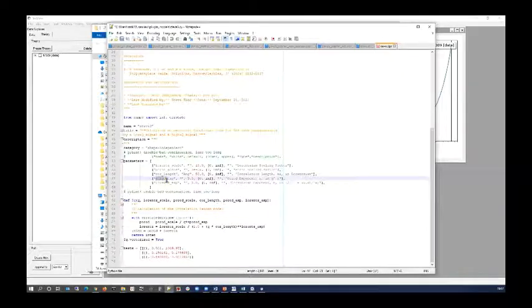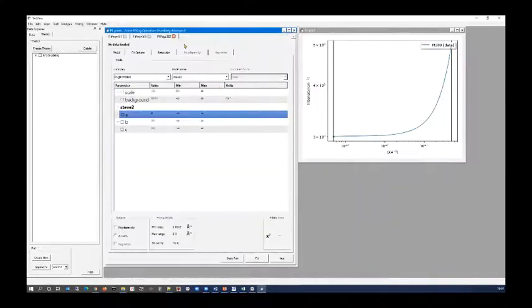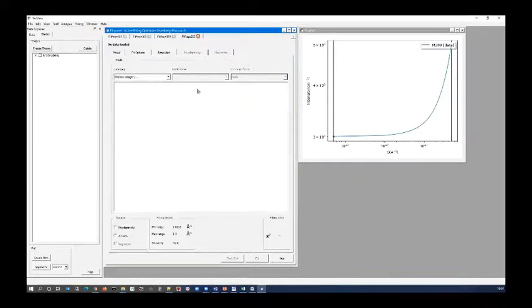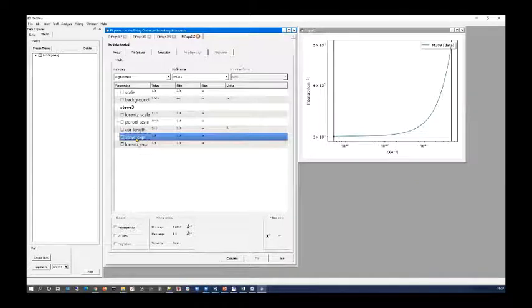I don't have time to do anything really clever in here, so what I'll just do is change the name of a variable so you can see that it actually has. I'll do this Steve exponent. So I then save this particular model. We can go back to SasView. Do a new fit page to be certain. It would be under plugins. Called it Steve 3, and there you go. You can tell that it's the one that I've just edited.